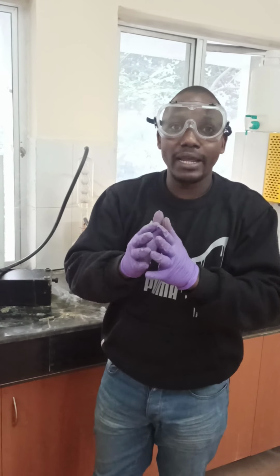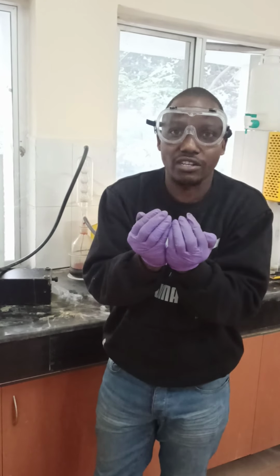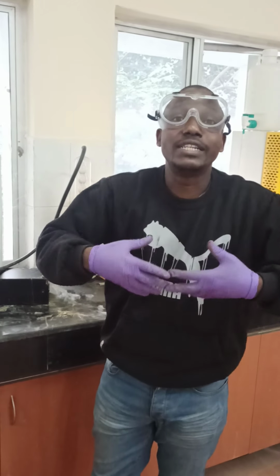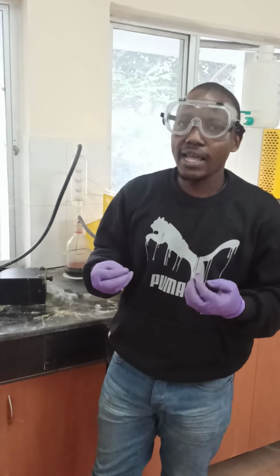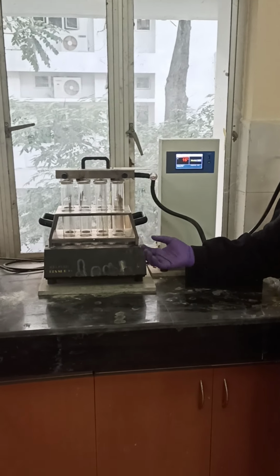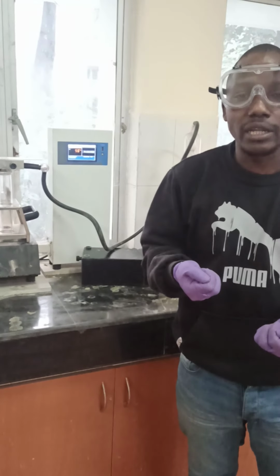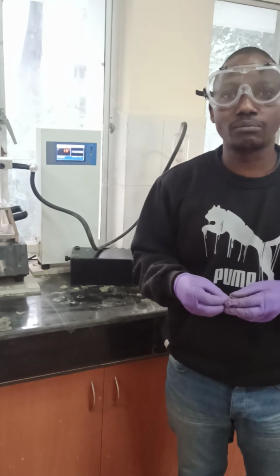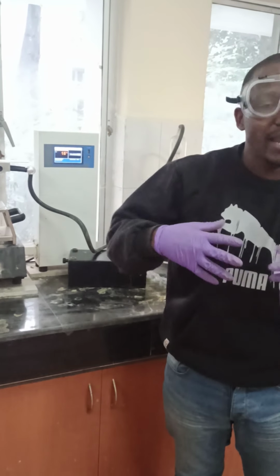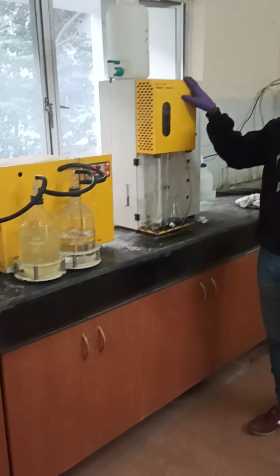Having been informed that nitrogen normally comes in a bonded style within a complex structure, it's not easy to detect it in a normal way. Therefore, we need to take a particular sample into the digesting system, where we digest that sample to extract the nitrogen in the form of ammonium ions or in a simple way that is easy for detection.